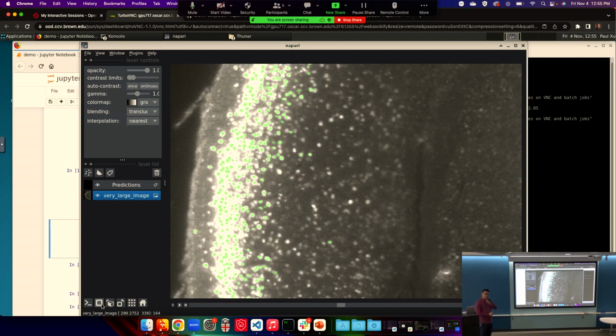Sorry, I just got a little confused about where you're saying the limitations are. Because the whole point of Dask is to load something that is bigger than your memory. Right. So what you're saying is that somehow Napari's communication with them is not enough to understand what to load or not load for multiple slices? Is that the issue? No, not that. If you want to have a view of that, depending on the way you chunk, sometimes you're going to have to load all of it into memory. So there are different ways of doing the chunking.